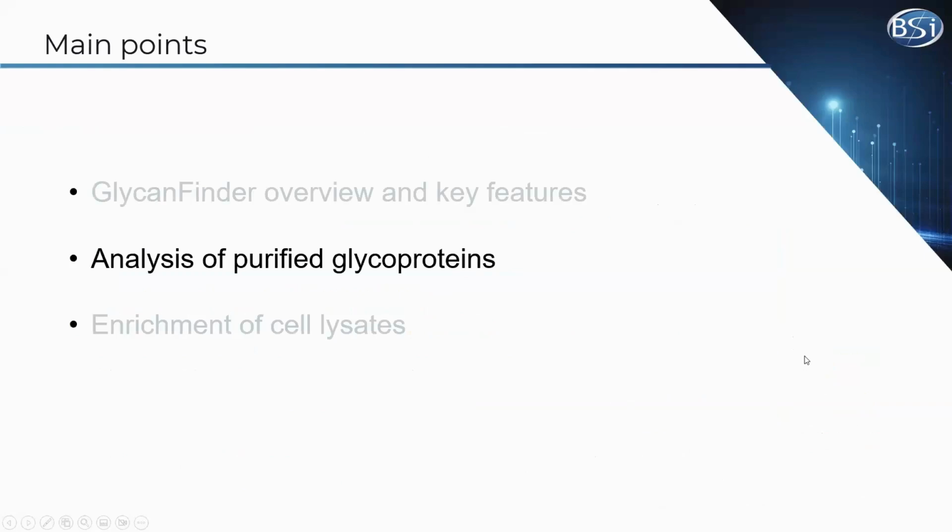Okay, so I'll go into what we've been working on within the BSI lab now. And first, going over some analysis of purified glycoproteins.